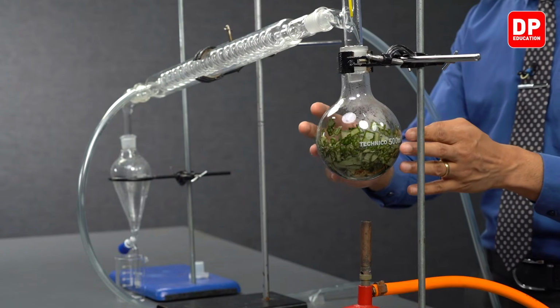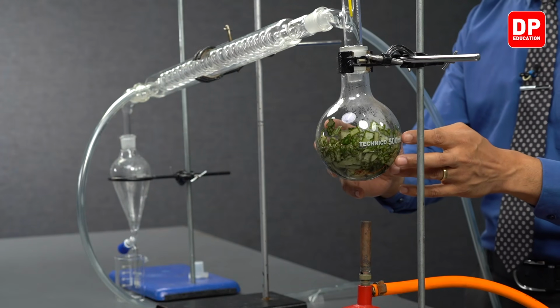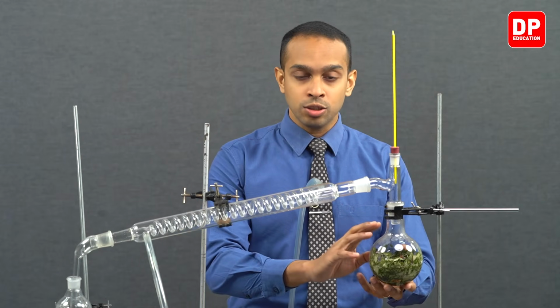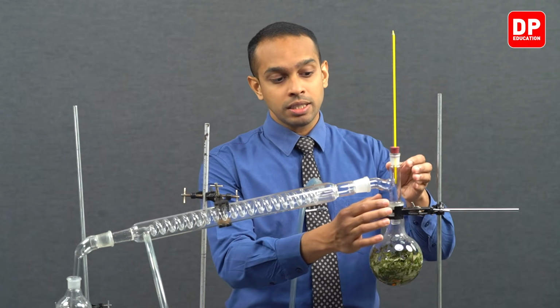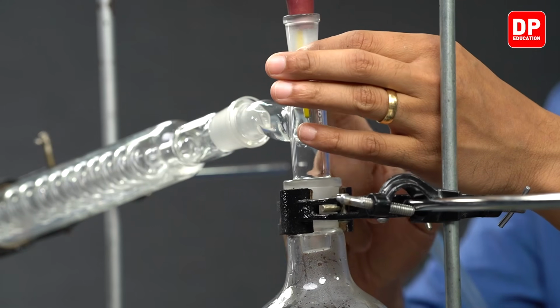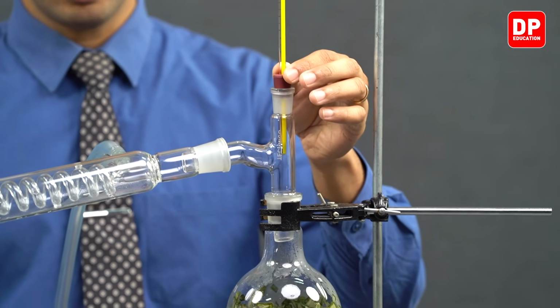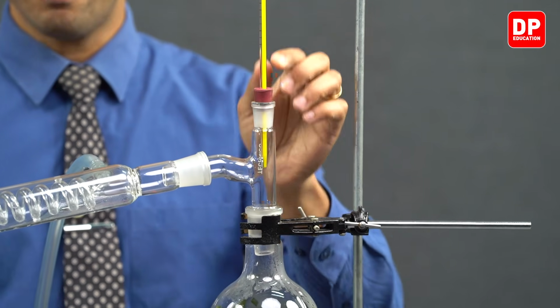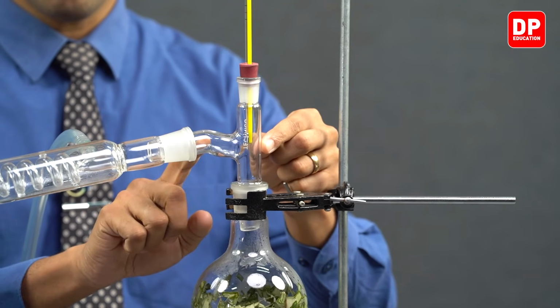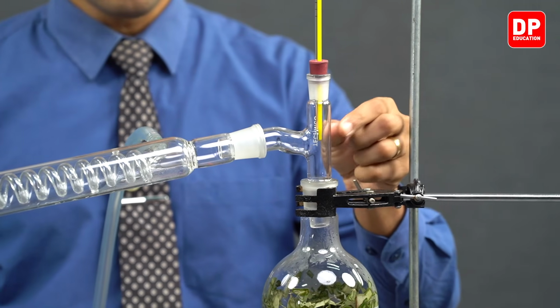We have the round bottom flask that is filled with cut pieces of cinnamon leaves as well as 100 milliliters of water, and we can see that this round bottom flask is connected to a three-way adapter. On top of the three-way adapter you can see we have our thermometer fixed so that the bulb of the thermometer comes in front of this horizontal arm of the three-way adapter.